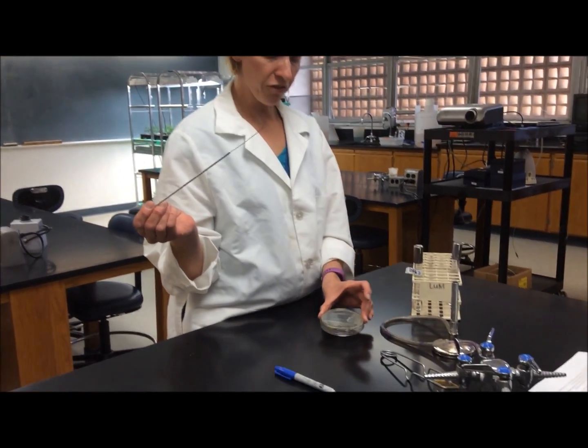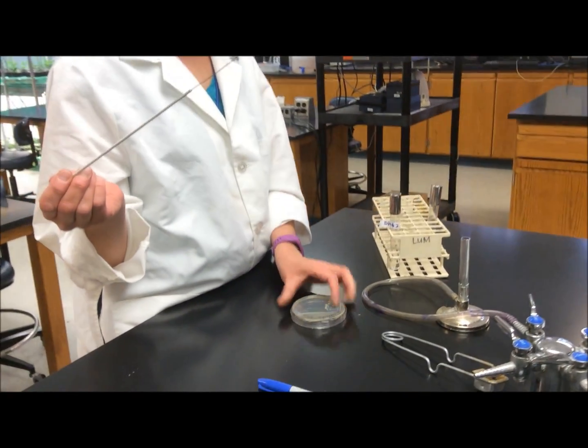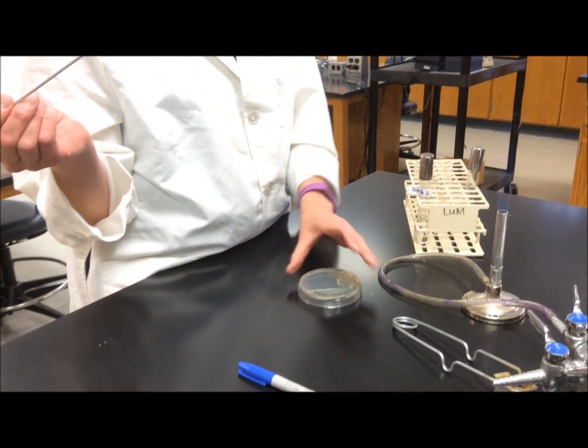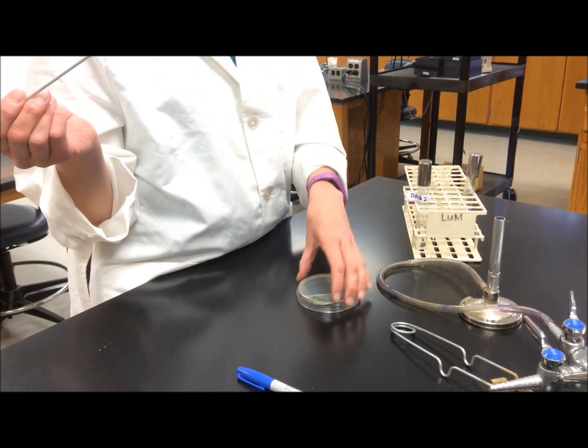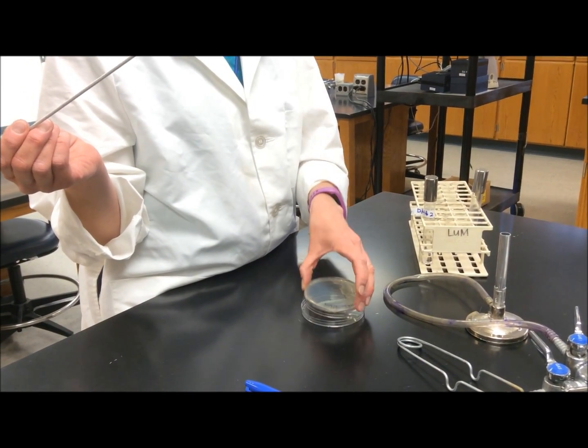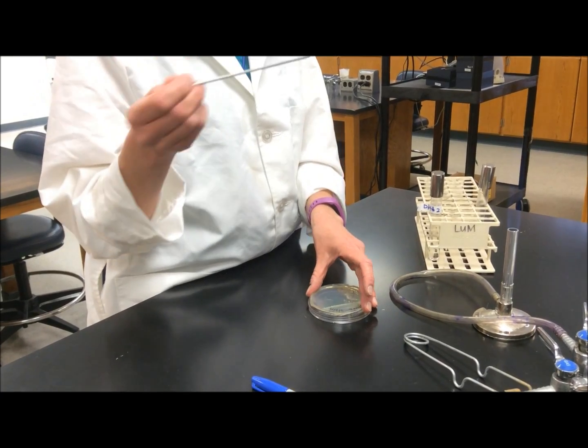When working from a solid culture — from a culture that's growing on agar — you want to leave the lid of the agar plate on the bench so that you can easily, with one hand, lift up the agar section of the plate to grab your colony before inoculating.